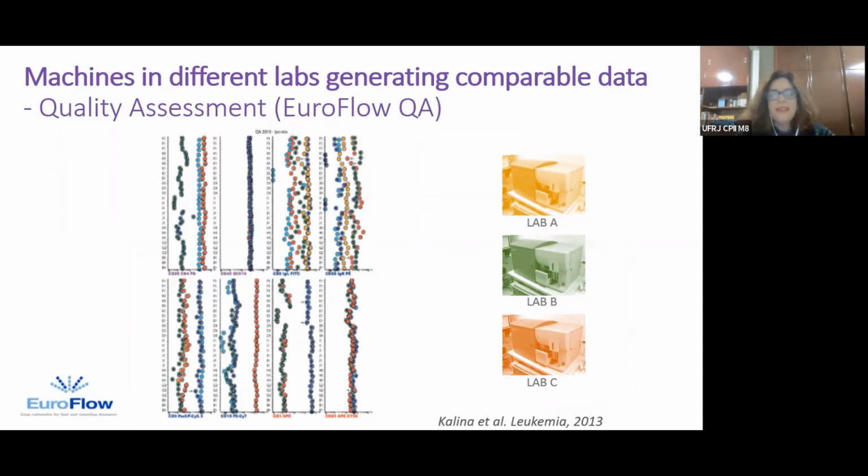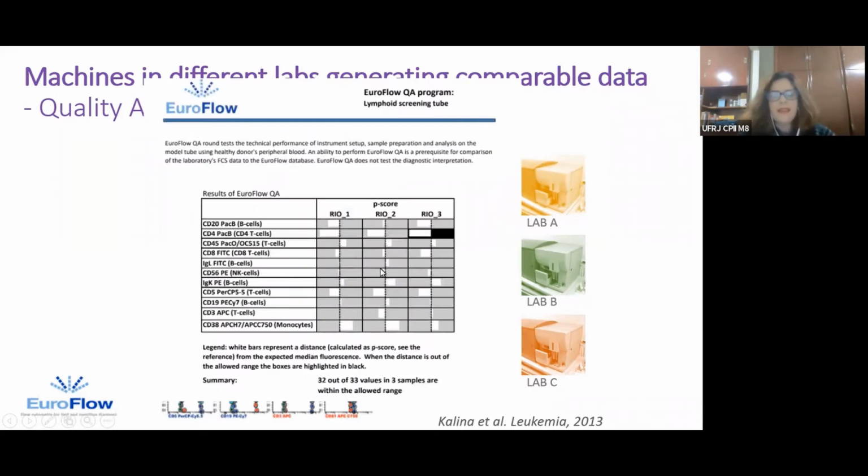Here we have an example of the quality assessment of Euroflow that compares samples from different labs in different countries, and they give us our scores.